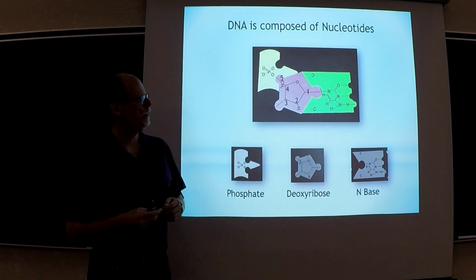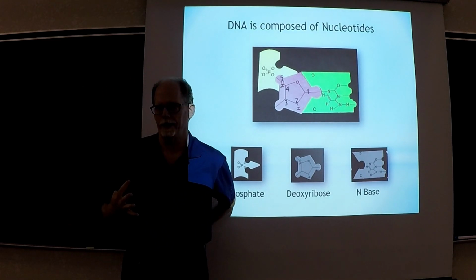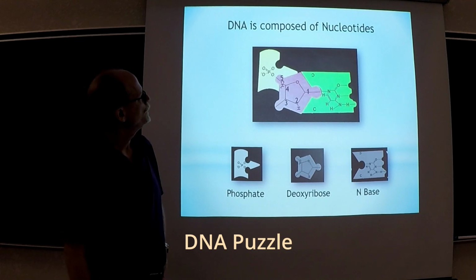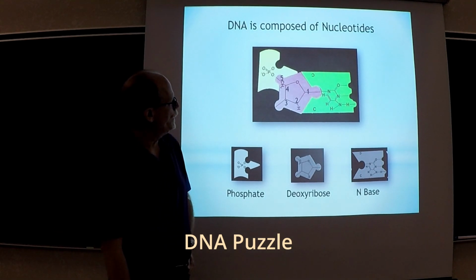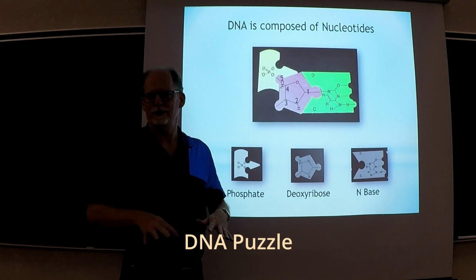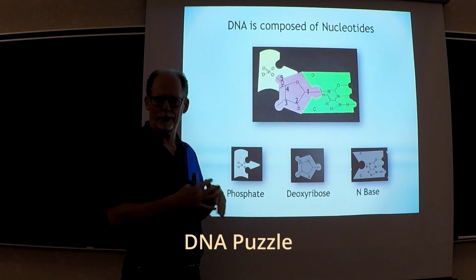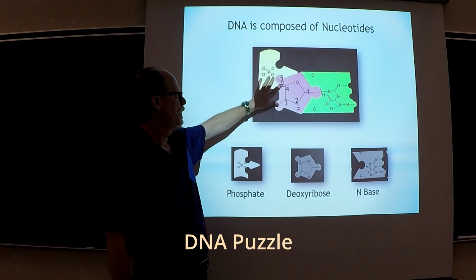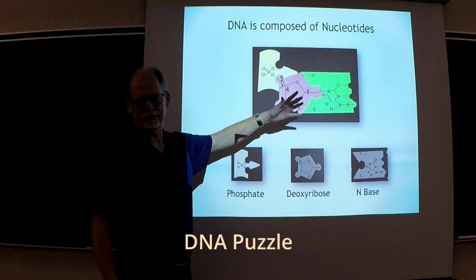And then the other part of this lab was to look at what's called the DNA puzzle. Right, so DNA is another macromolecule. There's not a test for this specific molecule, right? We wouldn't have done a test for it in lab. We would have had you put together these puzzle pieces.